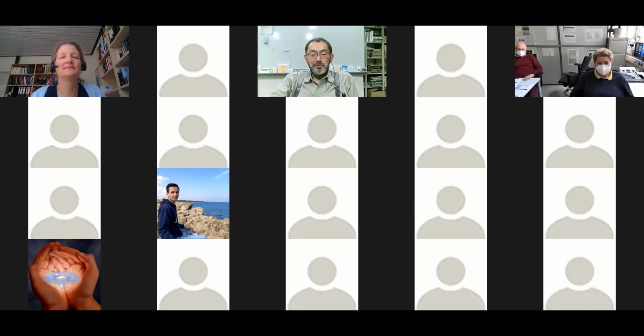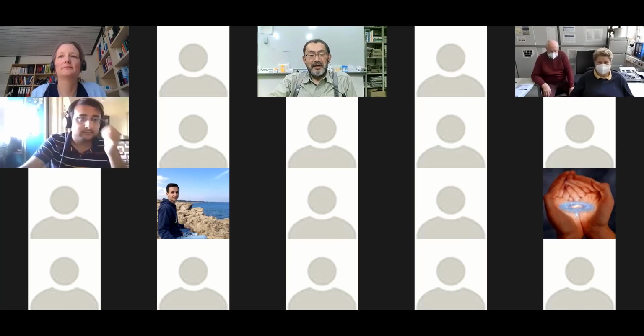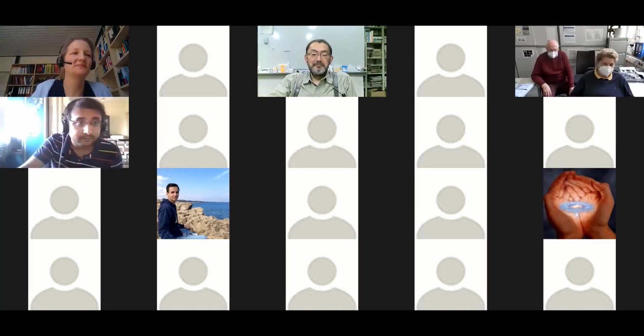So even the user avoids too strong X-rays. And so it's a trade-off. If you want to detect the trace elements, the X-ray should be strong enough. But if you want to achieve linearity between the concentration and the X-ray intensity, you must use a low counting rate. This is my opinion, not accepted, I'm not sure. Okay, good, thank you.